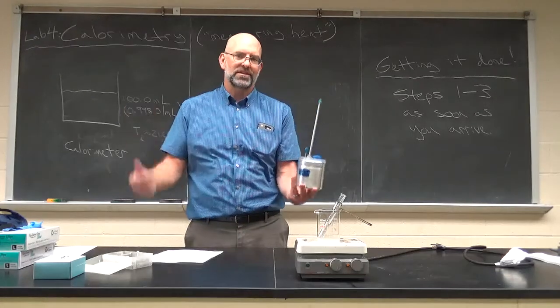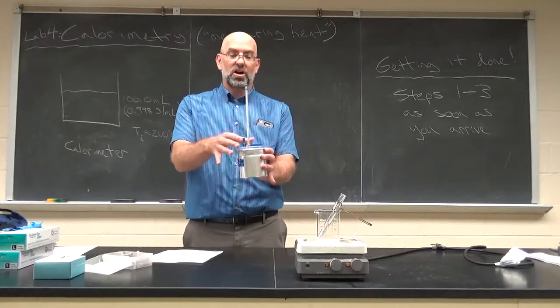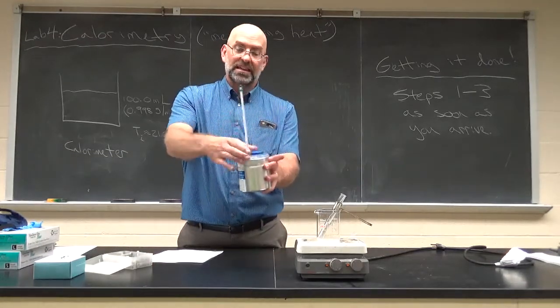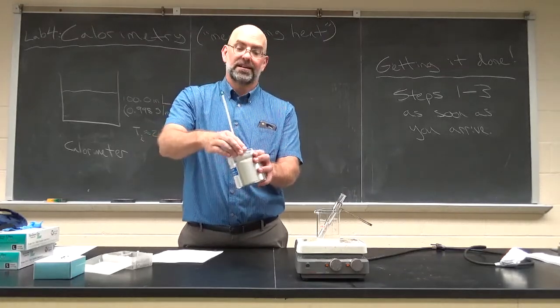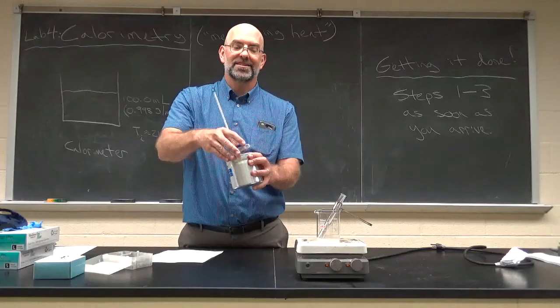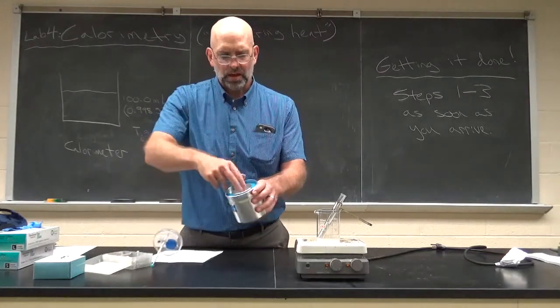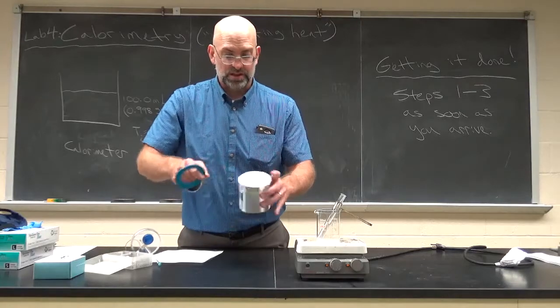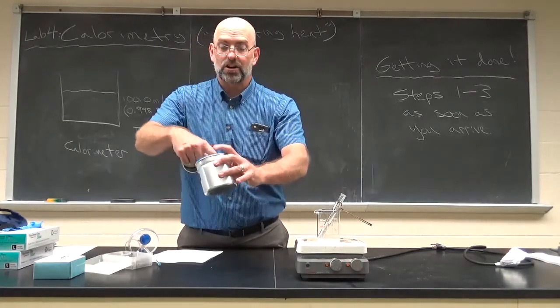Coffee cups, I don't think you need me to tell you what coffee cups look like. If we end up using this, it's called a calorimeter. It has a nice lid on it. Coffee cups, we don't have the ones with lids like you get at Dunkin' or at Starbucks. And this whole thing lifts out. And you can look at this. There's actually styrofoam in there. So it's a pretty good insulated container.